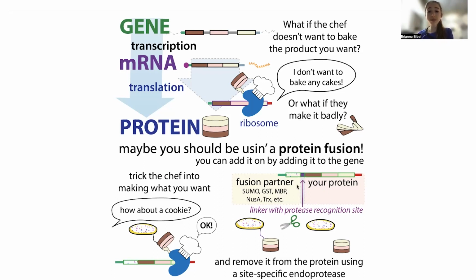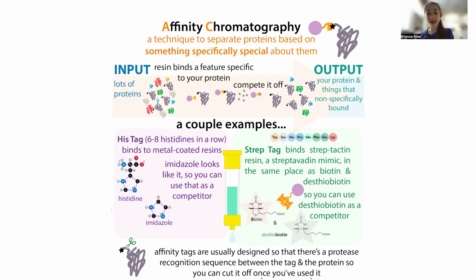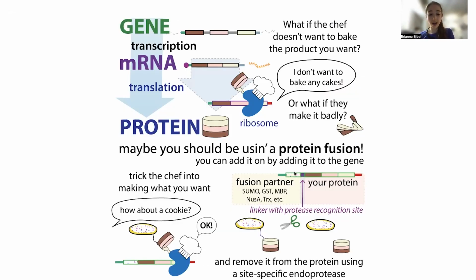and this is going to help us cut our protein off. And this can be really, really important with these fusion partners because unlike just having a small his tag on the end, a small little tag to help you with affinity purification, which we'll talk about, these are actually whole proteins. And so these can get kind of big, and we'll discuss the relative sizes of some of them a little later. But basically, you often are going to want to cut it off later. But beware that when you cut it off, your protein might now go back to clumping up. And so one of the ways that the fusion partner was helping was actually not just with the expression, but with keeping your protein happy and soluble.